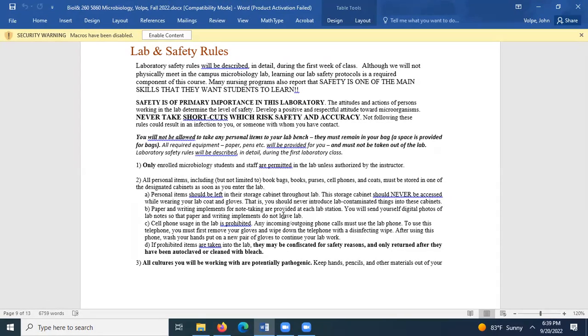And then when you walk away from the door and the cubby hole, you will go and wash your hands, put on your, let's see, you put on the lab coats first, then put on the gloves, and then put on maybe goggles. Take off the goggles, take off your gloves, take off your lab coat. Yeah, that's the right procedure. And the point is you walk over to the sink, wash your hands. That is considered part of the lab, and everything that's in the lab stays in the lab.